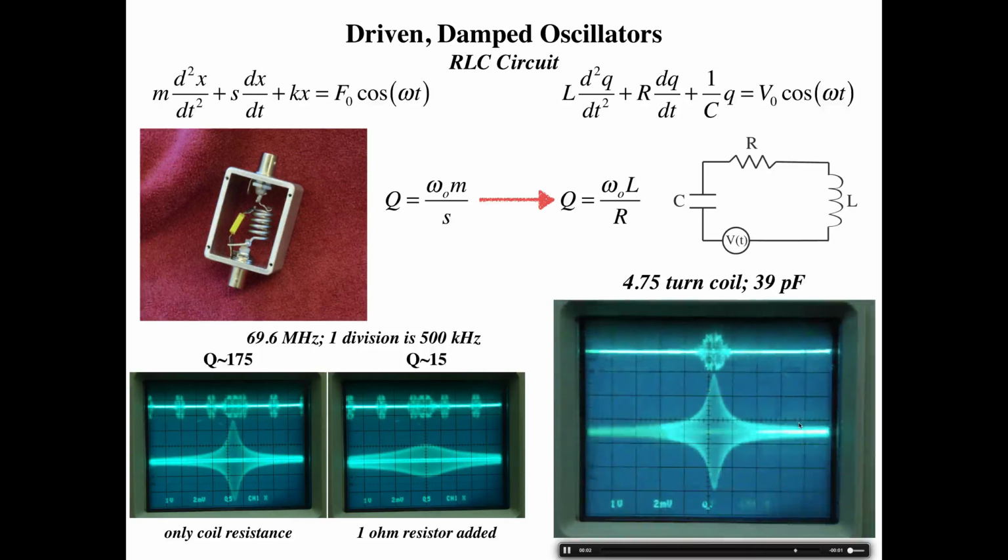So the point is that for resonant circuits, you get this voltage enhancement, or correspondingly a current enhancement in the circuit, when you drive it at the right frequency, in this case the resonant frequency. And that's a very important point for resonant circuits. For example, this voltage source could be either your high power amplifier, or in an NMR probe it could be the source of your signal from your nuclear spins and so forth.